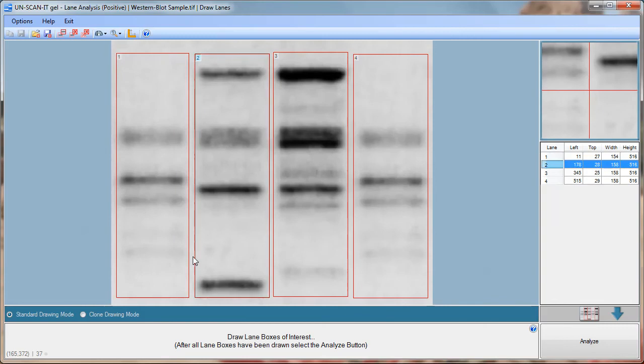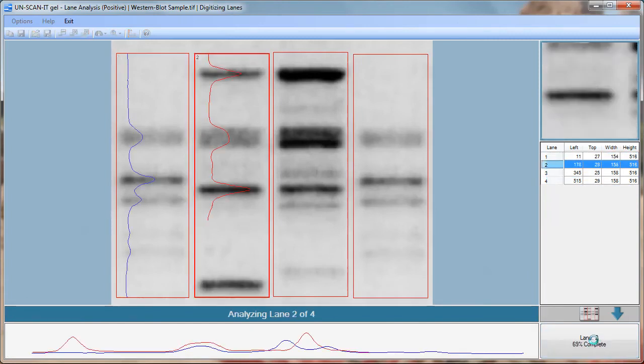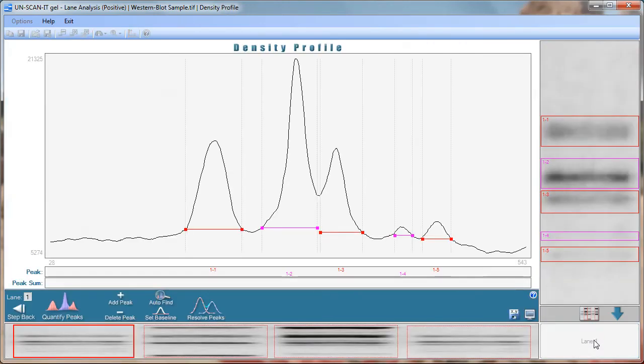After all the boxes are placed on the image click the analyze button in the lower right corner of the screen. The UnscanitGel software will then analyze each lane which allows you to quantify each of the bands.